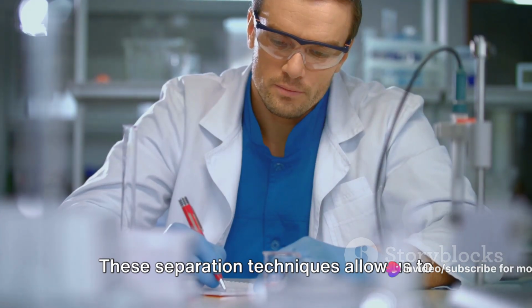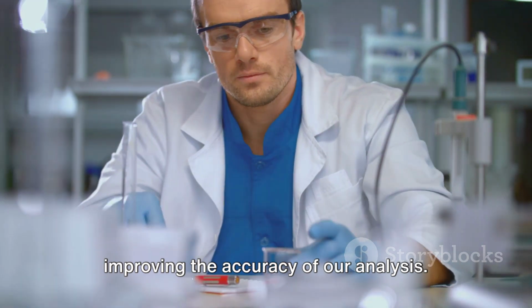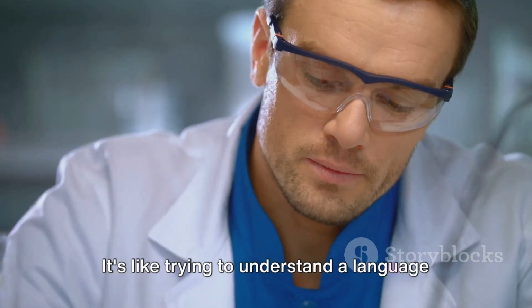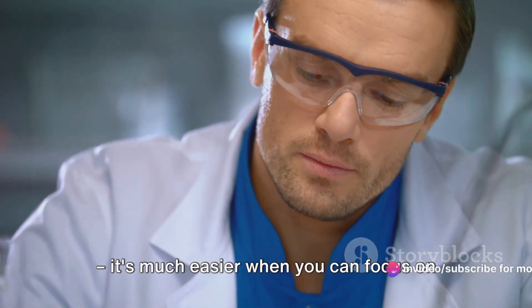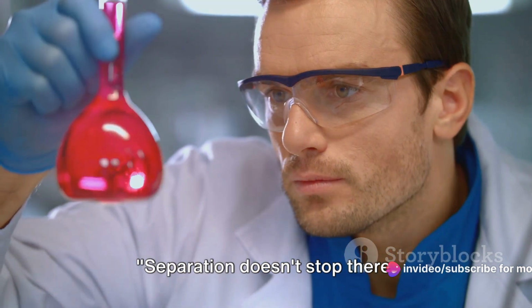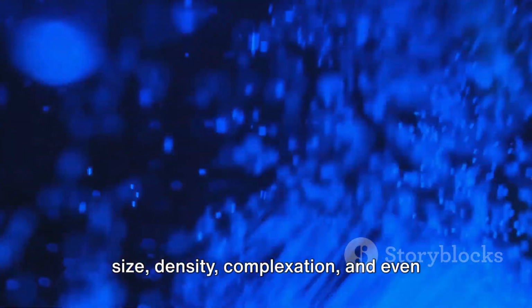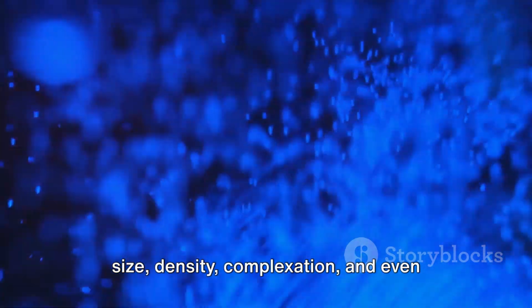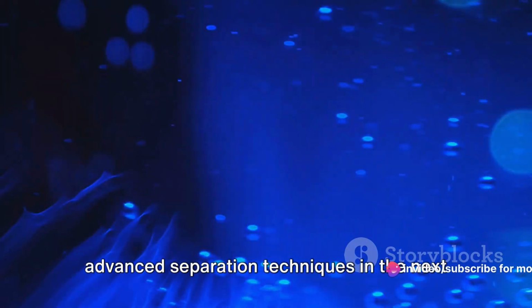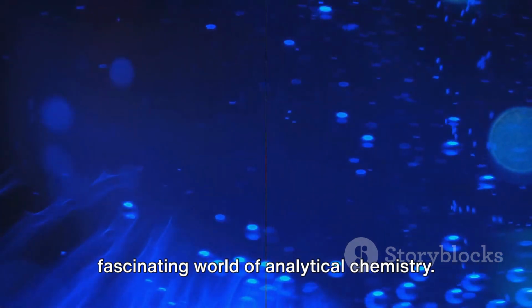These separation techniques allow us to isolate the analytes from interferents, improving the accuracy of our analysis. It's like trying to understand a language. It's much easier when you can focus on one word at a time rather than a whole sentence. Separation doesn't stop there. We can further refine our sample based on size, density, complexation, and even through liquid-liquid extraction. So stay tuned as we delve into these advanced separation techniques in the next part of our journey through the fascinating world of analytical chemistry.